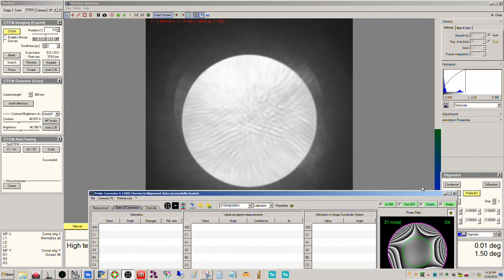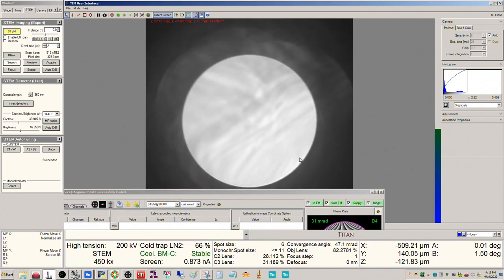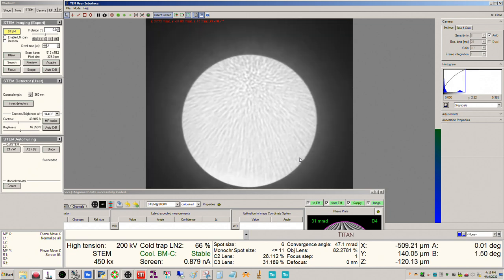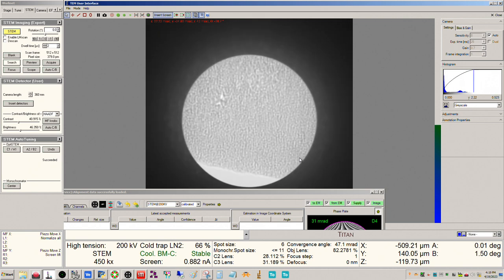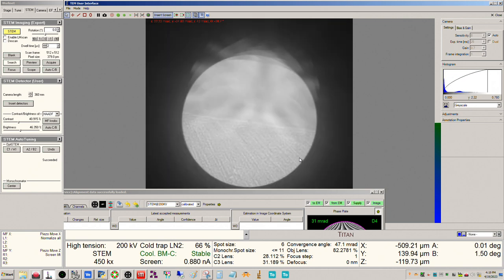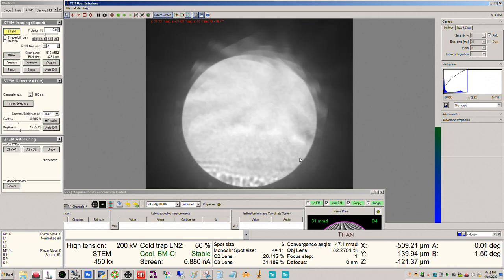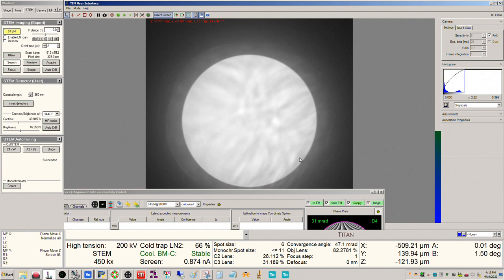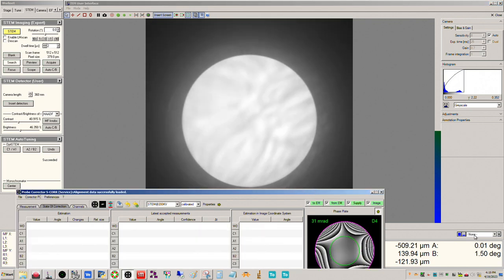Okay, let me see if there isn't. I'm going to move down here. So sometimes the crystallinity can make this a little tricky. Let's see if there's like a... So this is the indium phosphide now, but I want to see if there's like a part here. So this is completely amorphous. So it's going to be a little easier to see here.